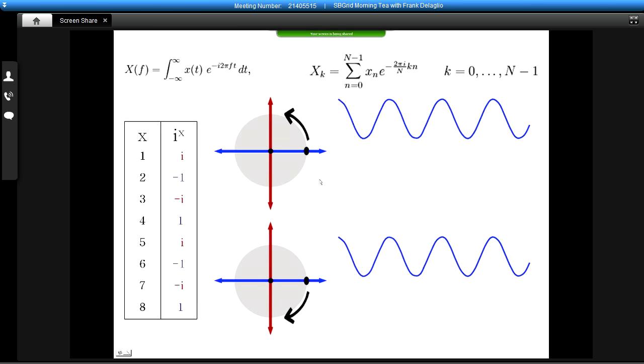But now, why do we care about real and imaginary data? Well, let's consider the two cases where we have an orbit that goes in one direction compared to an orbit that goes in another. If we only consider one component of this motion, we can't tell the difference between a clockwise and counterclockwise frequency here.